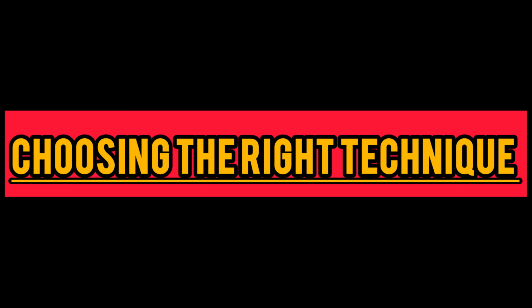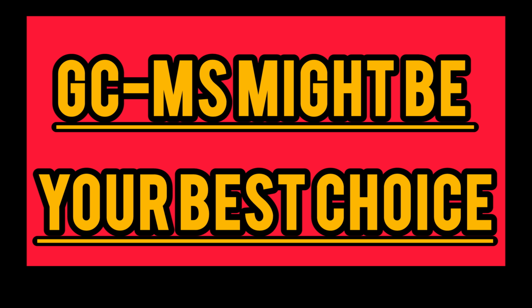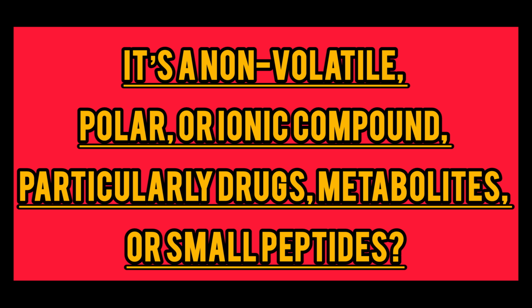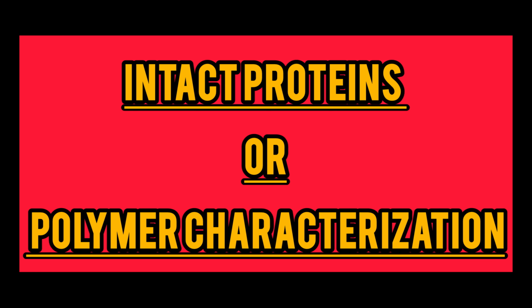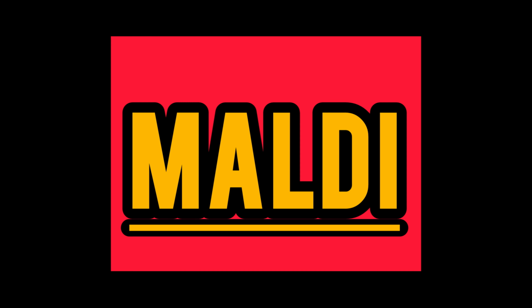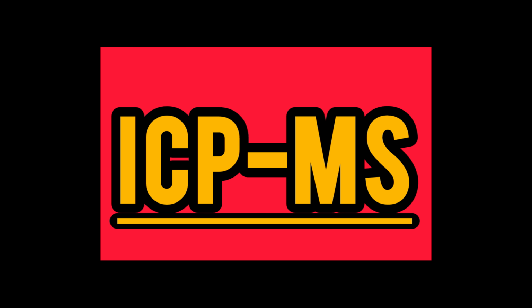Now let us see how to choose the right technique. First, what type of compound are you analyzing? If it's volatile, small molecule, and you have access to spectral libraries, GCMS might be your best choice. If it's a non-volatile, polar, or ionic compound, particularly drugs, metabolites, or small peptides, LCMS is ideal. For intact proteins or polymer characterization, MALDI might be more appropriate. And for elemental analysis, ICP-MS is your only real option.